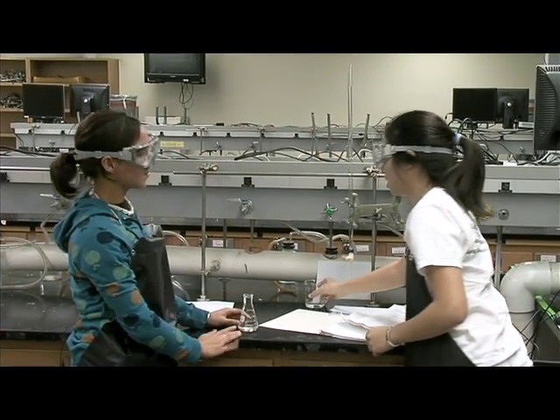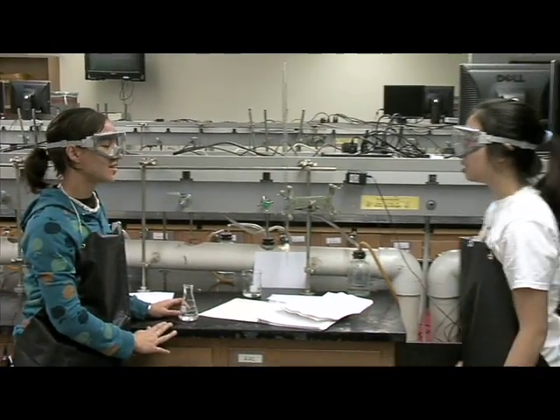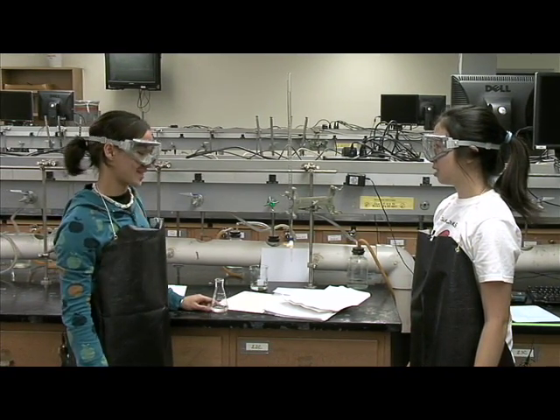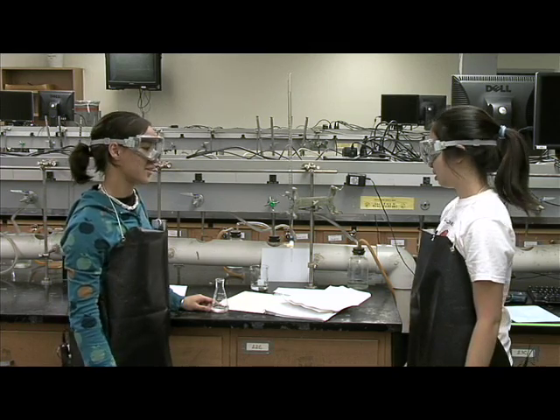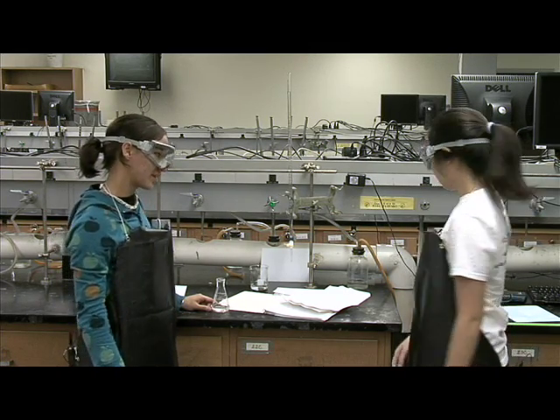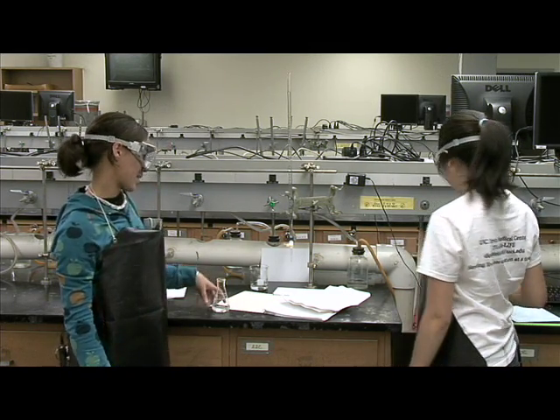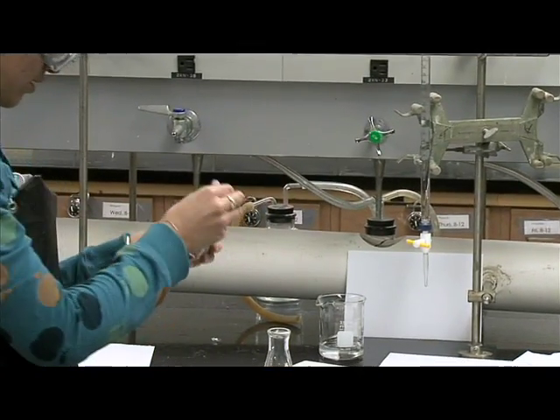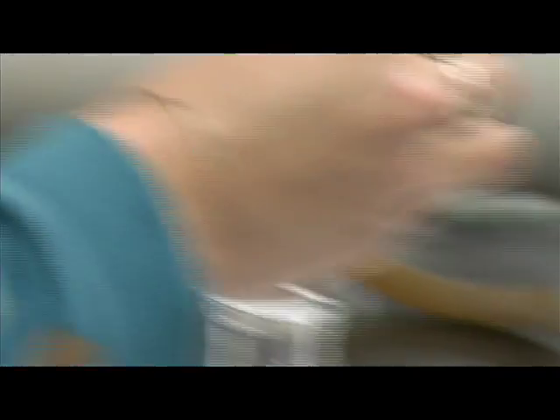Could you pass me the phenolphthalein? The phenol what? The phenolphthalein. It's the indicator, the purplish pink stuff. It's what tells us when the titration has reached the endpoint, which is when all the titration is complete and it changes the color to pink. Okay, here you go. Thanks! A couple drops. That should do it.